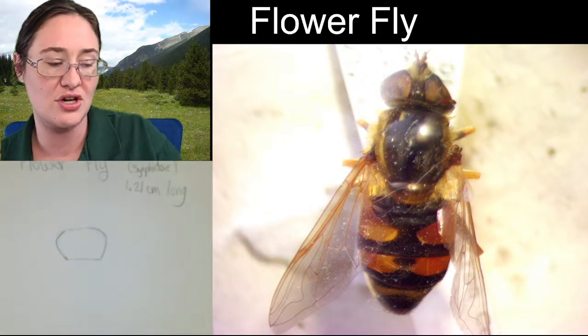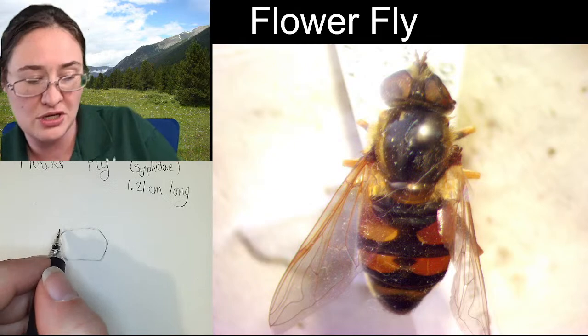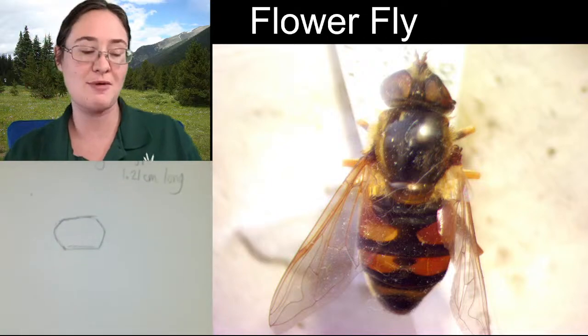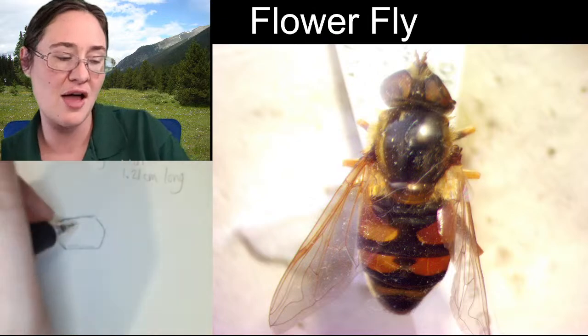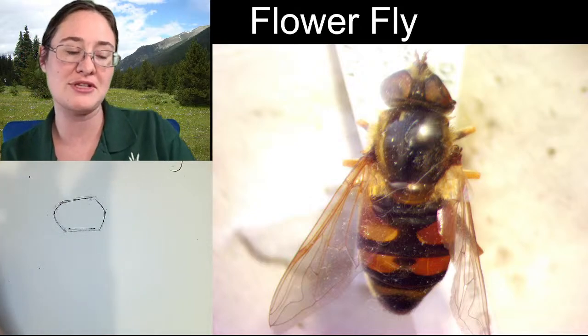I just find that it is easier to sketch all of those pieces around the antenna. It's easier once we've zoomed in a little bit. And we want to make sure that we're getting the overall size of all of the body parts before we zoom in. So that's what we're doing. So we've got this head shape that's going to get fixed when we zoom in. And we know that one's about 0.2.